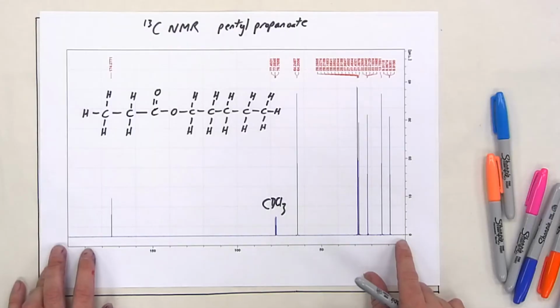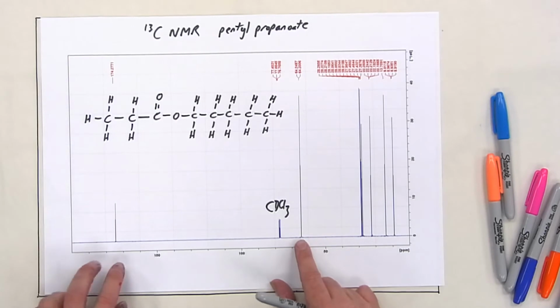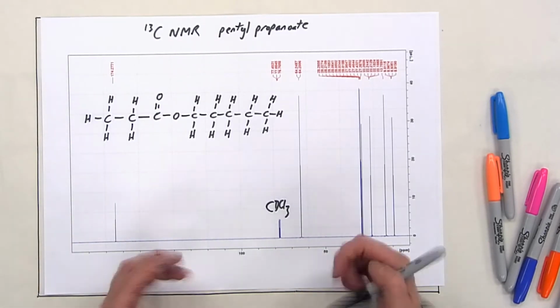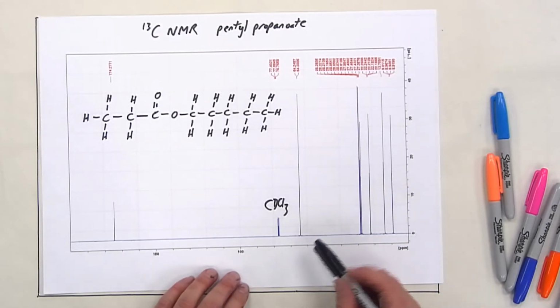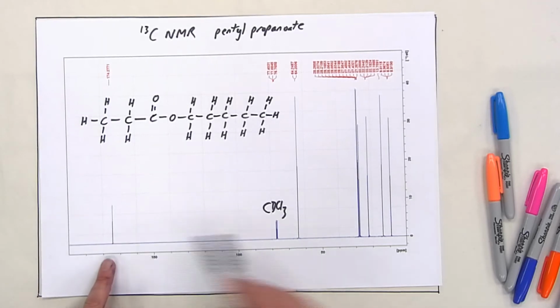So we're going to look at coupling in a carbon NMR. What we currently have here, this spectrum, which was recorded by Matt, doesn't have any coupling. It's a so-called decoupled spectrum. And what we're going to try and do is predict what coupling we would see in a so-called off-resonance carbon NMR. So we're just going to focus on the two peaks we discussed before.